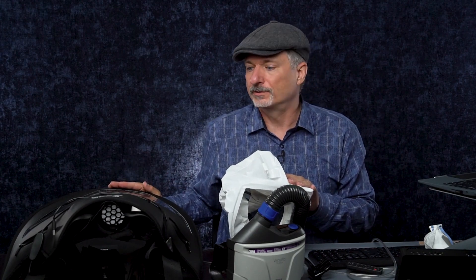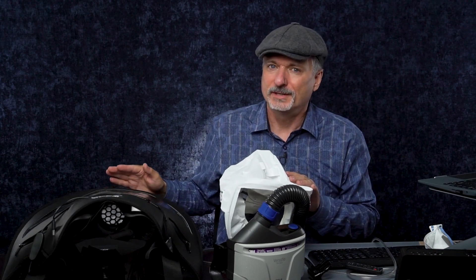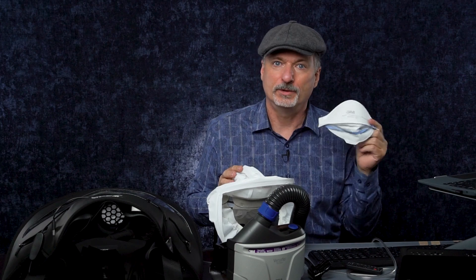The Biovisor was a really innovative attempt at providing protection, and it did provide some protection — but not the level a powered air purifying respirator should provide. It didn't even provide as much protection as the N95s it was meant to supplement when those weren't available. So it's an interesting product with some protection, but now that it's kind of a relic, it's not worth pursuing unless you're going to modify it. We'll look at that in another video to see if we can actually make this work better.